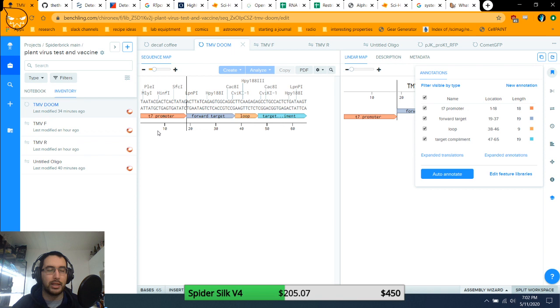Like, that's a 1 day thing. So realistically, this whole process would take about three or four days if I had all of the reagents and everything works on the first go, which, let's be honest, it won't. If everything goes wrong immediately, then that'll get dragged out to about a week and a half. Or maybe my plants die before then, and then all of this is moot.